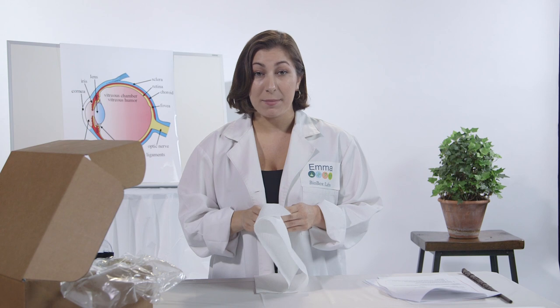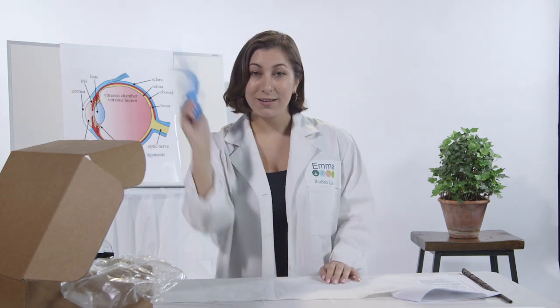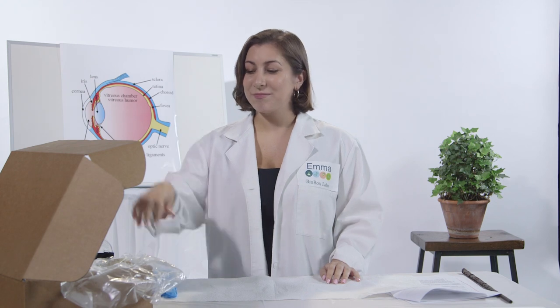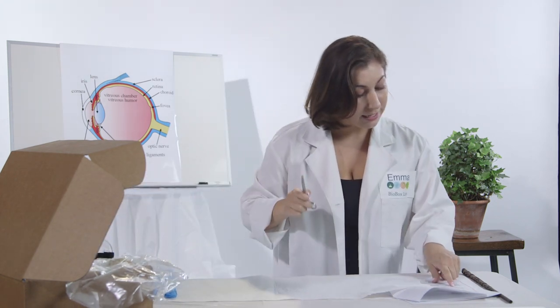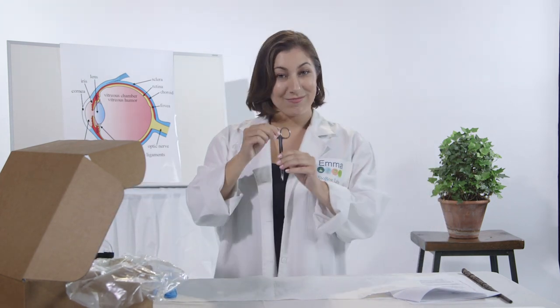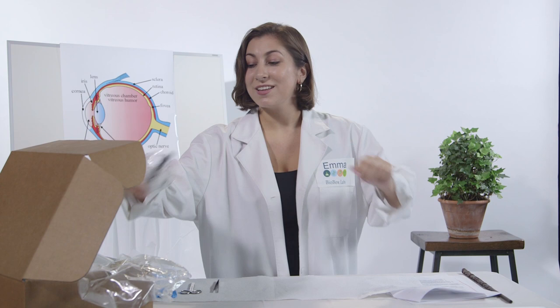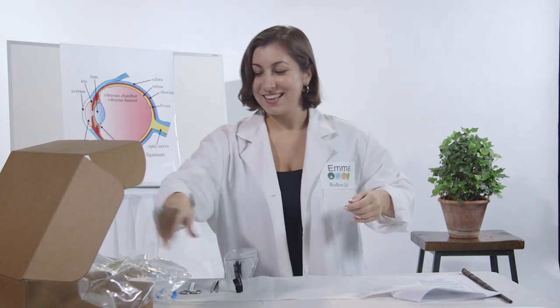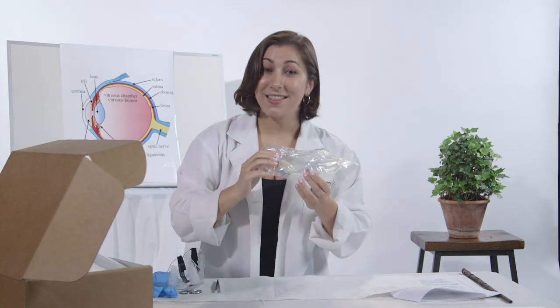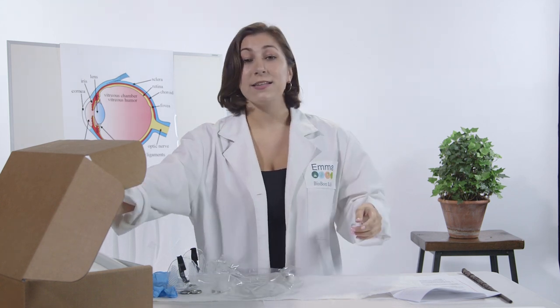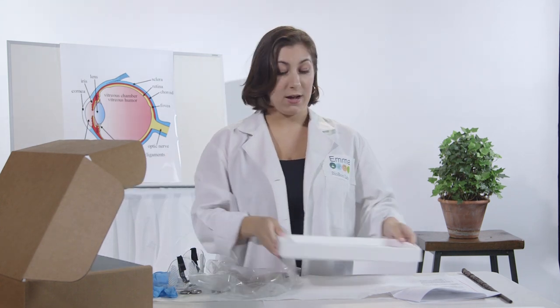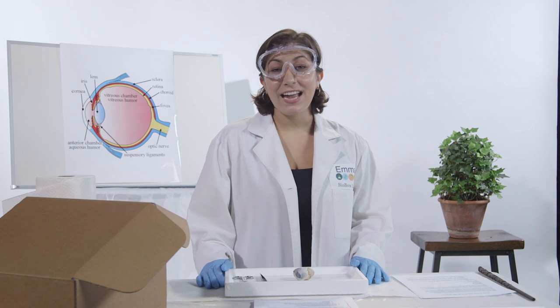So before we start the experiment, it's always very important to set out a paper towel. Next, you always need to make sure you have your gloves. Then, we need our fine point scissors. We can't forget the forceps, goggles, and of course, the eye. And lastly, make sure you always set your tray on top of the paper towel.